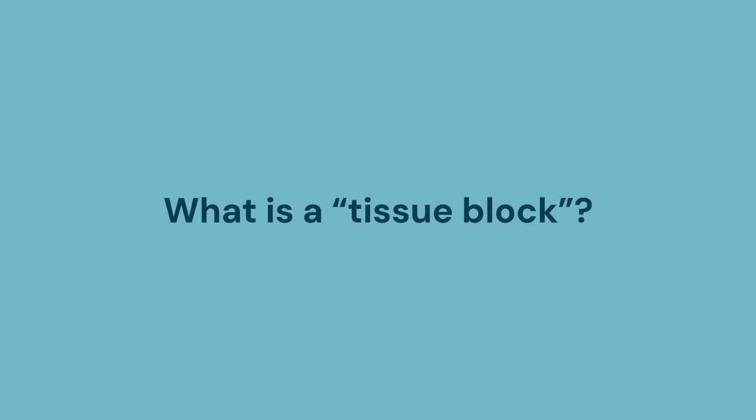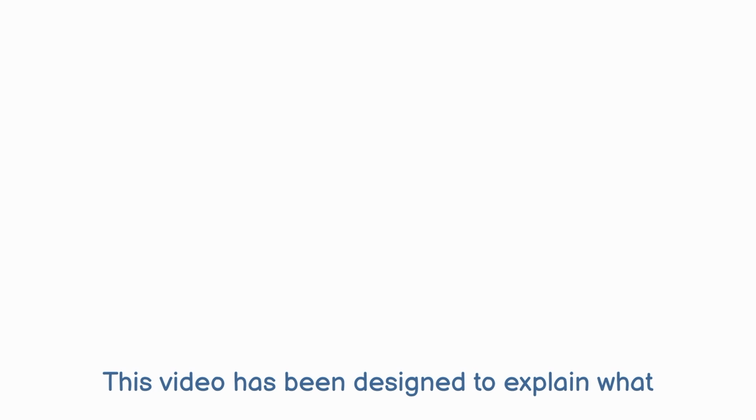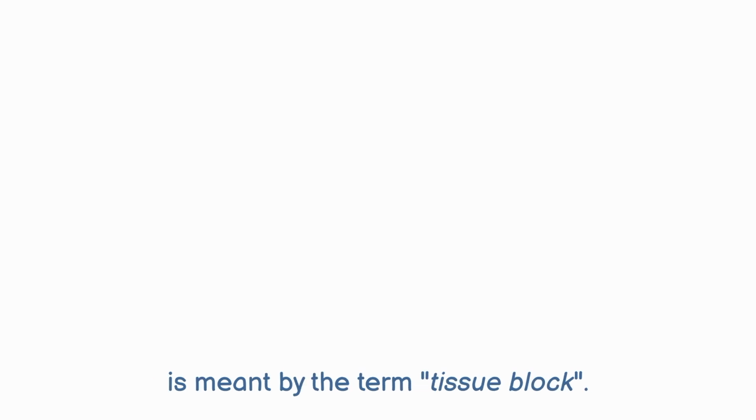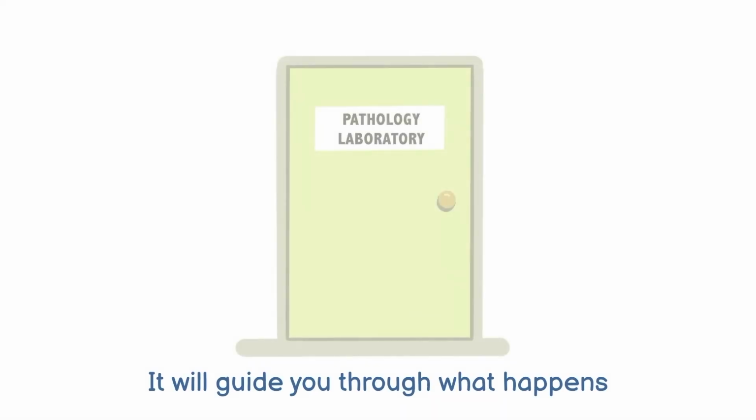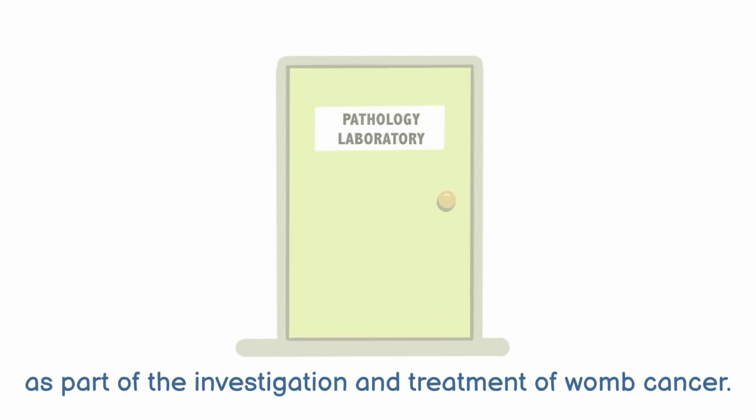What is a tissue block? This video has been designed to explain what is meant by the term tissue block. It will guide you through what happens to samples that are received in a pathology laboratory as part of the investigation and treatment of womb cancer.